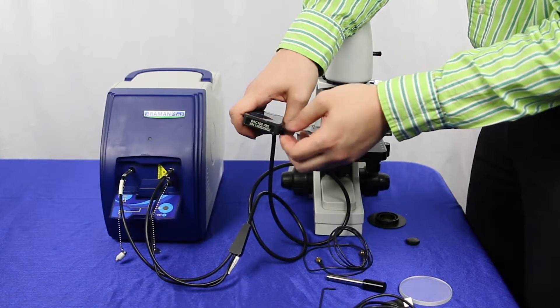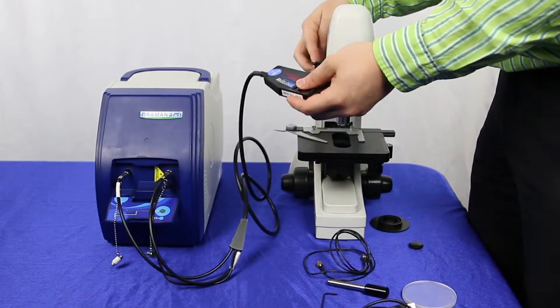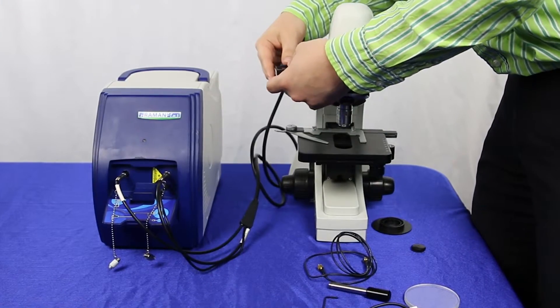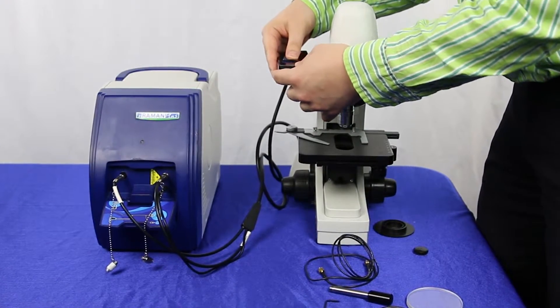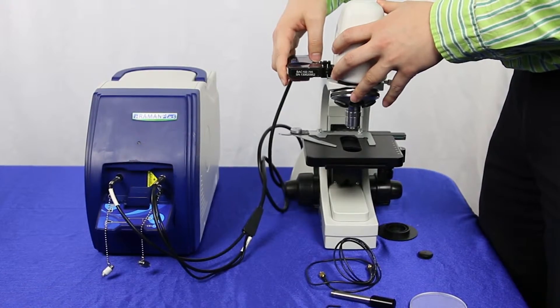Once that's screwed in, there will be a plastic piece here that you'll want to take out. You can then insert the probe into the microscope.